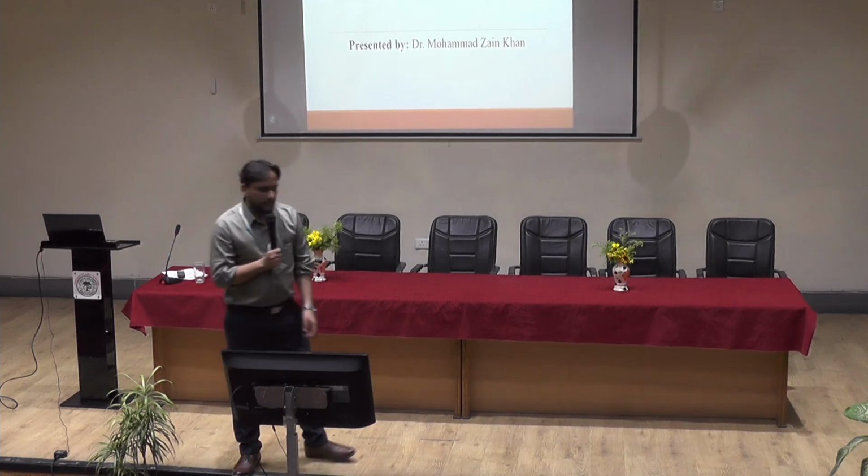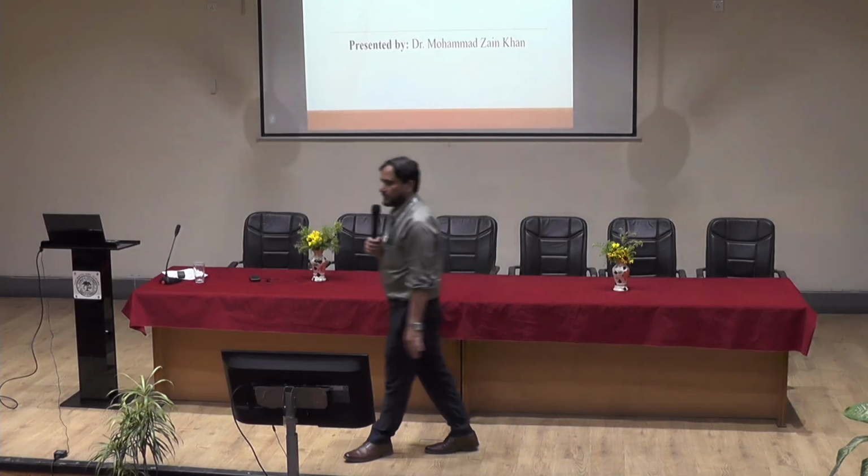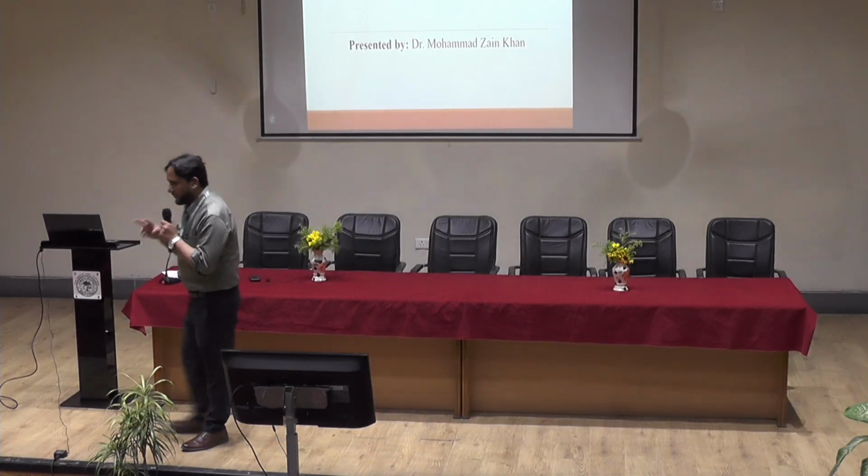That laser light is used as a light source, and charge coupled devices are used as detector. So these are the two main components of Raman spectrophotometer.